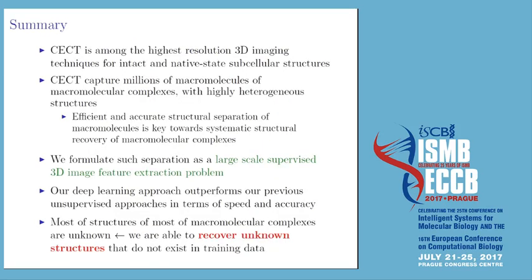So in summary, cellular electron cryo-tomography is probably among the highest resolution 3D imaging techniques for imaging the intact and close to native state subcellular structures. Nowadays, it's possible for CECT to capture millions of macromolecules, and these macromolecules are highly heterogeneous.